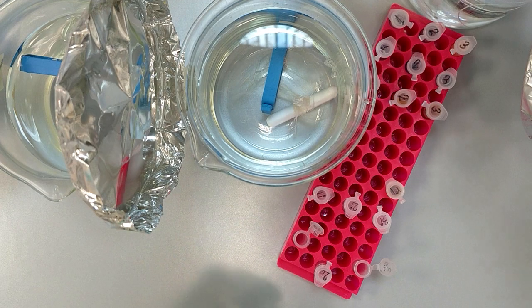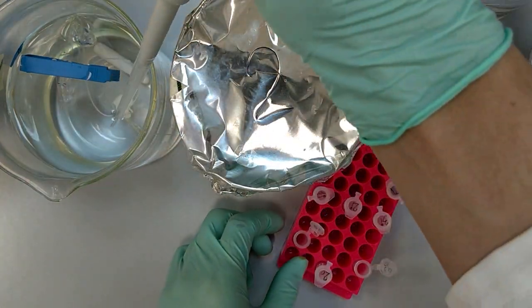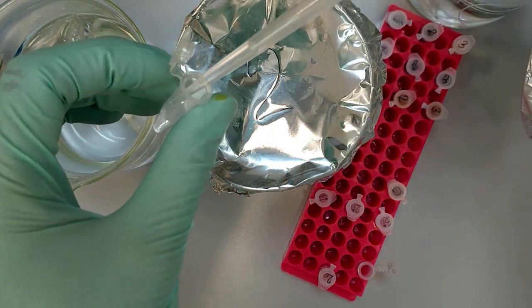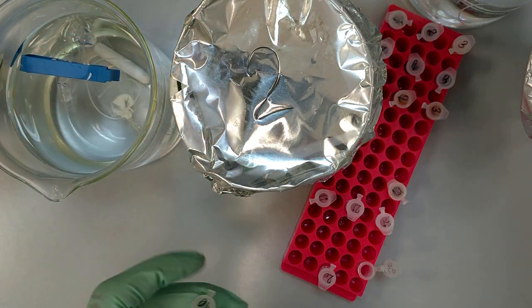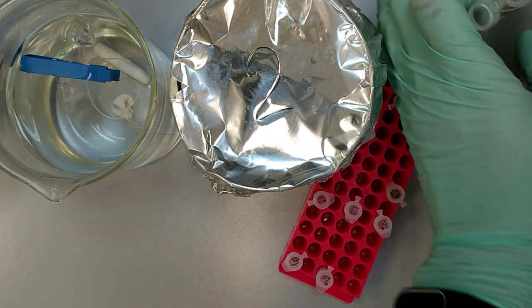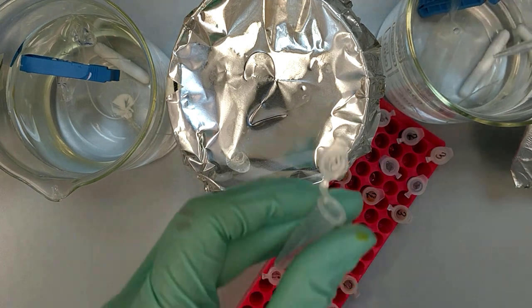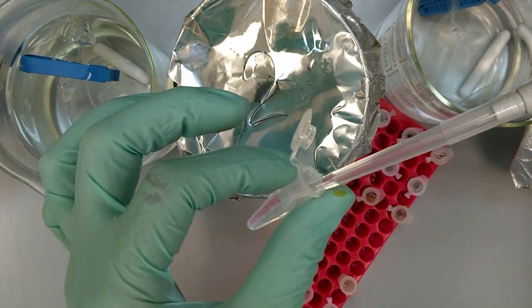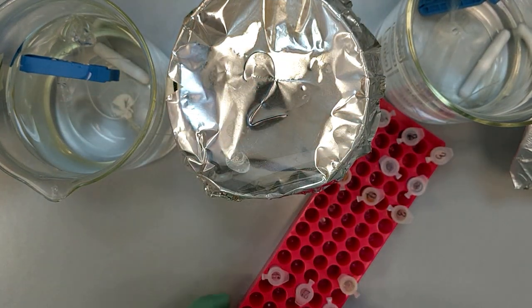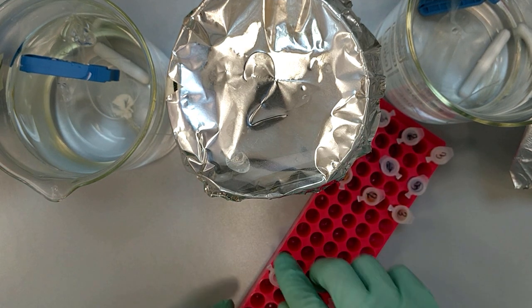And of course, we're going to change the tip every time we make a collection. So the outsides of the first secret solution and the outsides of the third secret solution, so you can see it here. So we take 1 ml and put it into each of these Eppendorfs. So next we're going to collect the insides. So it is the first row.